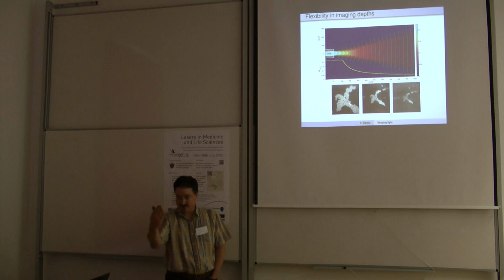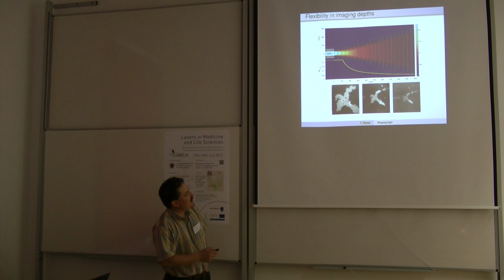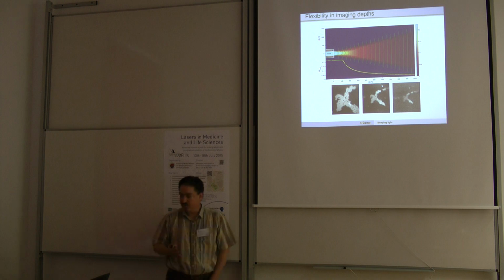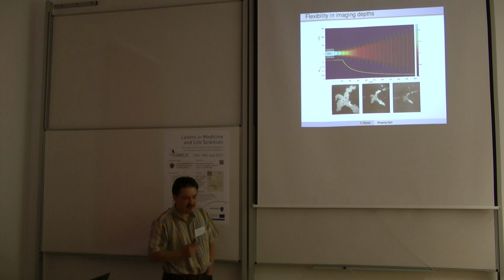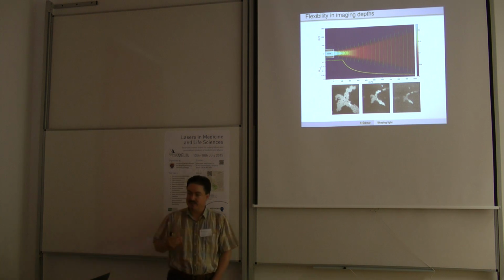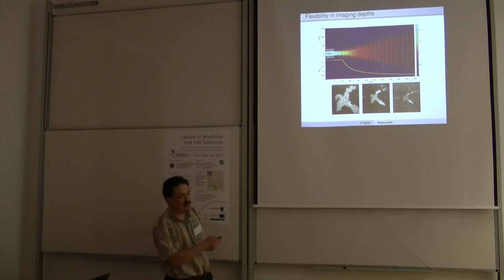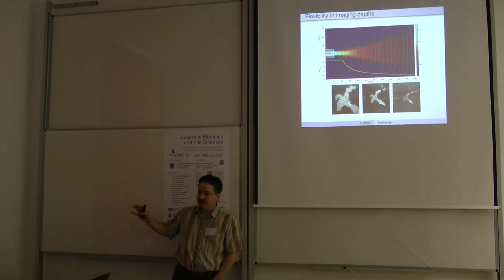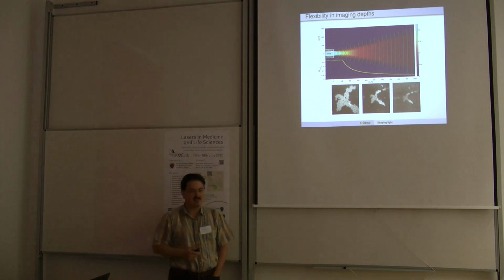It's basically like a line. The further it goes, the larger field of view you see, right? And if you go closer towards the fiber facet, you can get much reduced field of view, but much higher resolution. But the only thing that you need to do to change from one to another is to change the hologram that is outside. Right? So no mechanical components required, no zoom, no focusing stuff, just the hologram outside, which is, I think, the only technology that can do that.